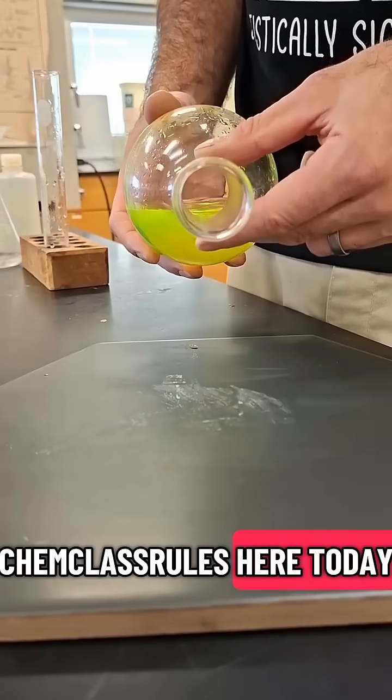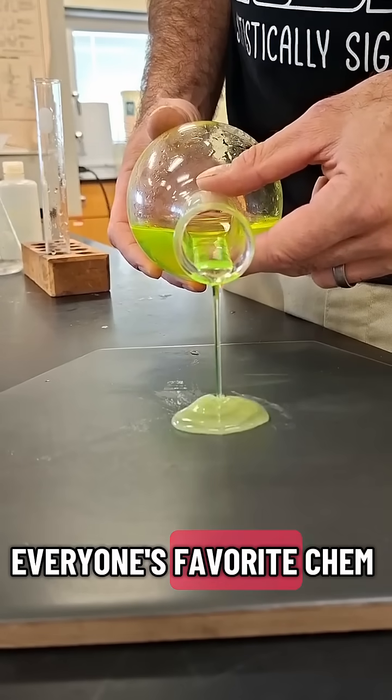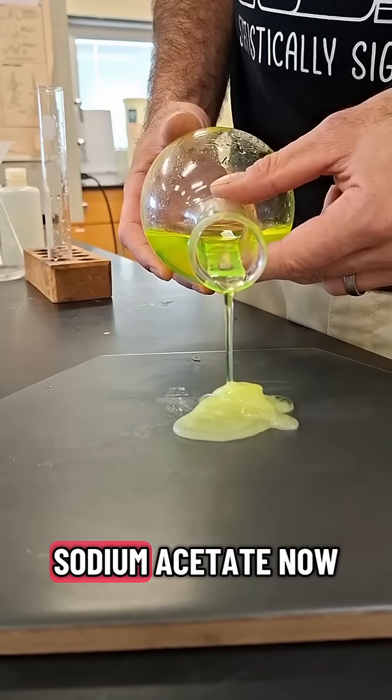Hey everybody, Chem Class Rules here. Today we're looking at everyone's favorite chem lab crash-out artist, sodium acetate.